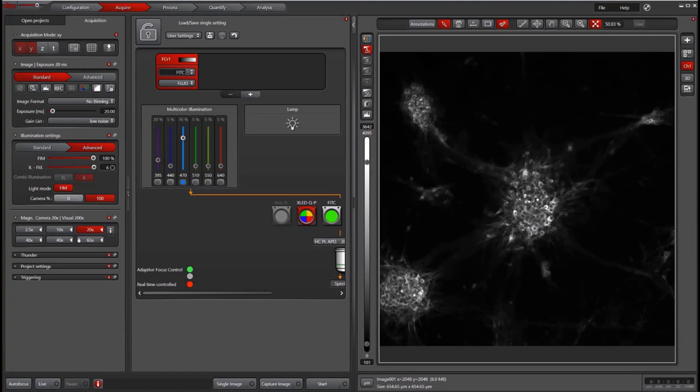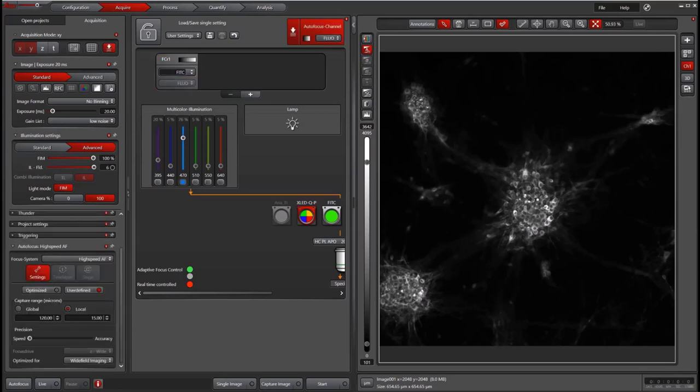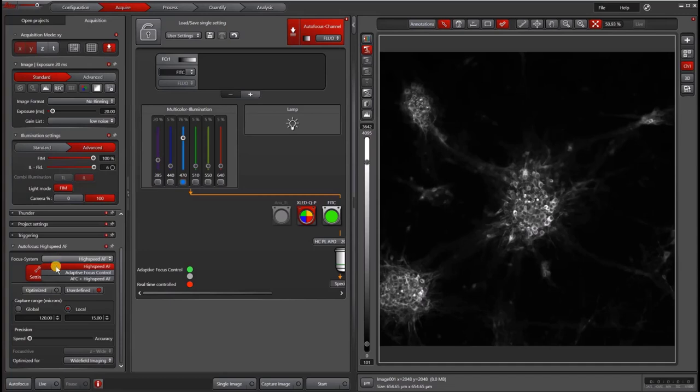To access the autofocus panel, click the high-speed autofocus or regular autofocus panel in the top part of your window. That will open an autofocus window. Under focus system, you have several choices on this system. The top option here is high-speed autofocus. If you only have best focus, that's where that will show up.